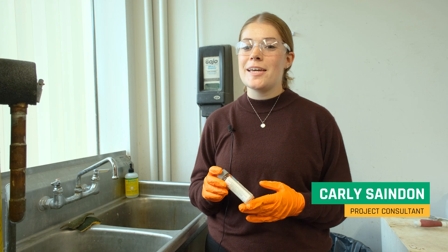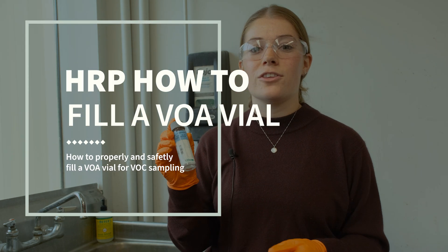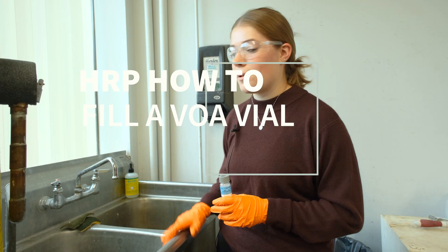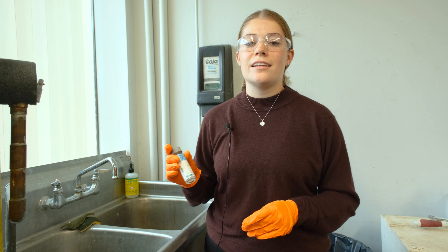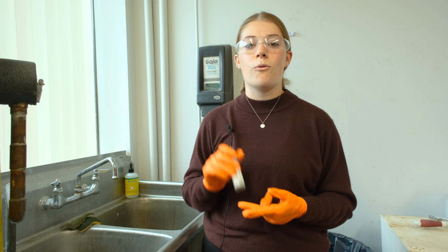Hi, I'm Carly. I'm from HRP, and today we're going to be showing you how to fill a VOA vial. VOA vials are for the sampling of VOCs — volatile organic compounds. Today we're going to be sampling from a sink, but this technique also applies to any other water sampling, including low-flow groundwater sampling or wastewater sampling.